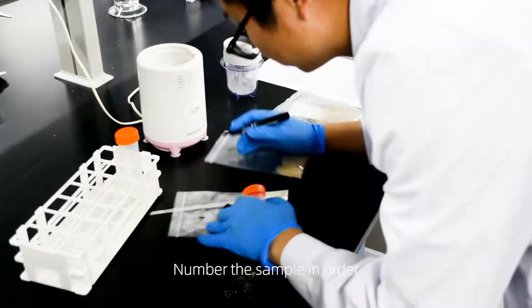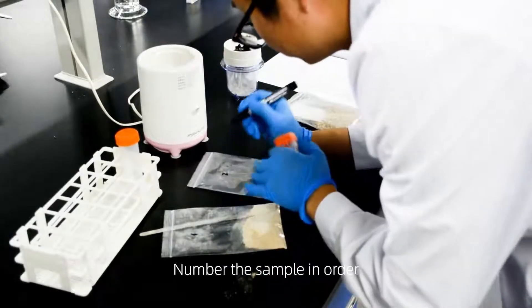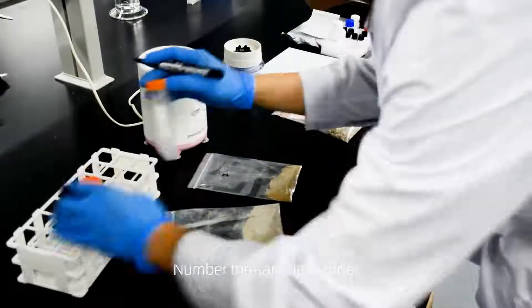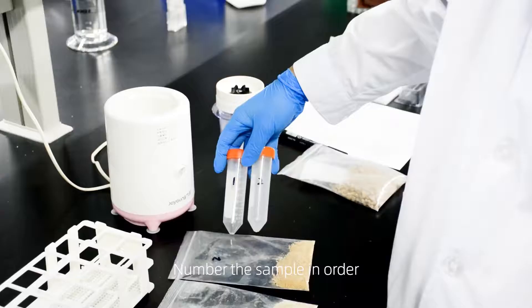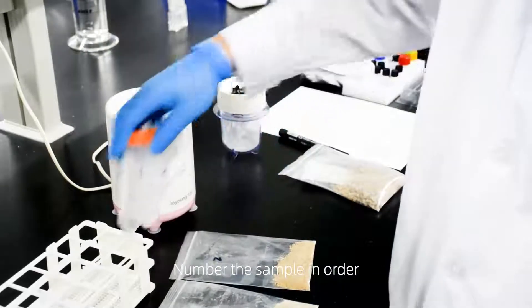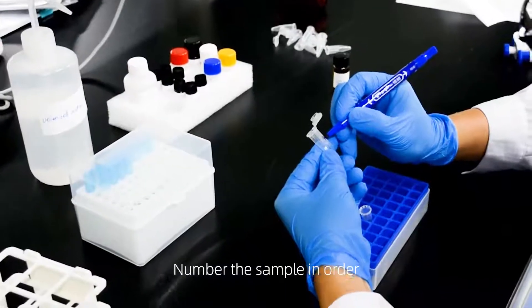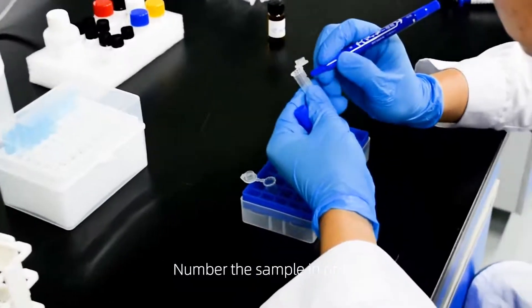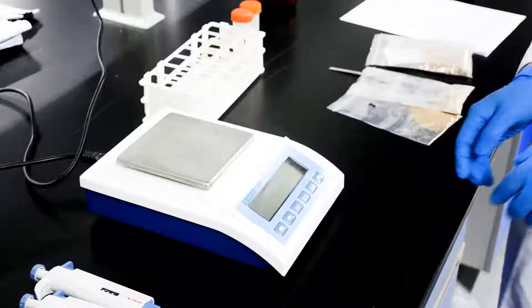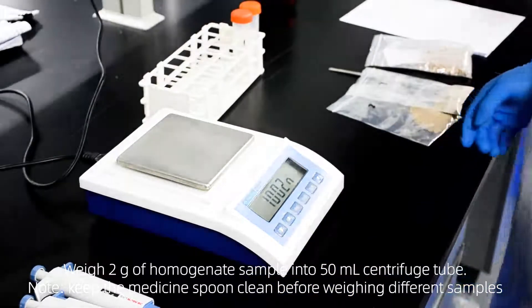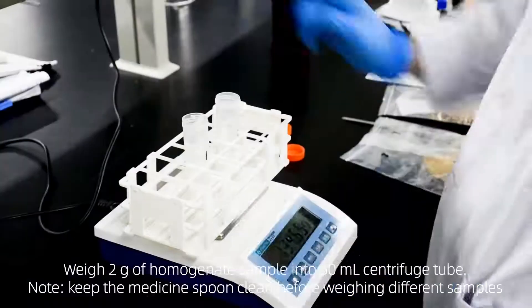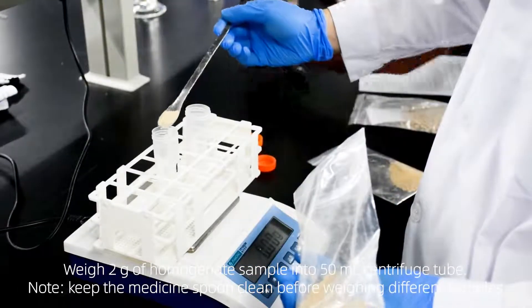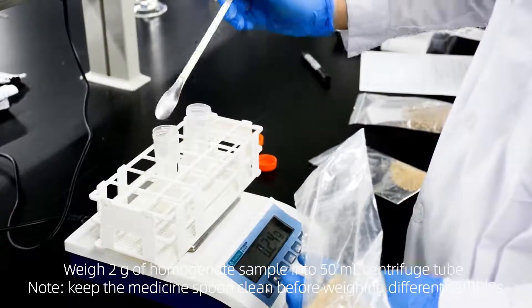Number the sampling order. Weigh 2 grams of homogenized sample into a 50 milliliter centrifuge tube. Keep the medicine spoon clean before weighing different samples.